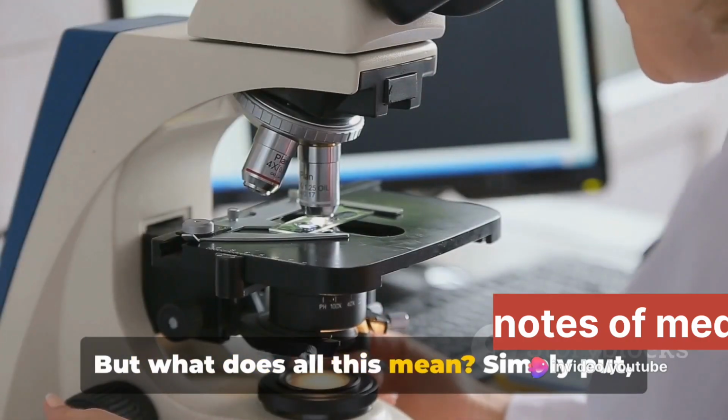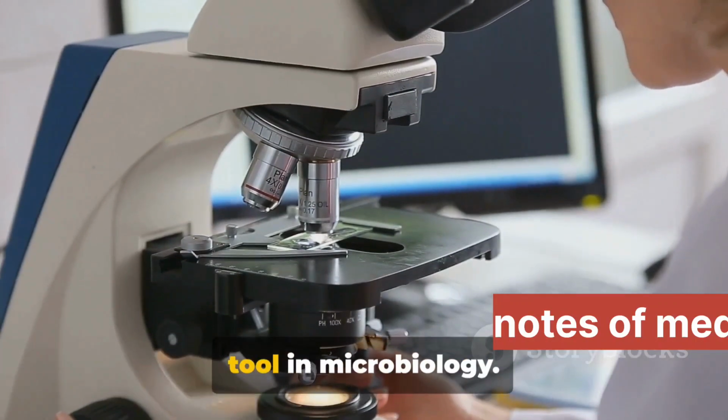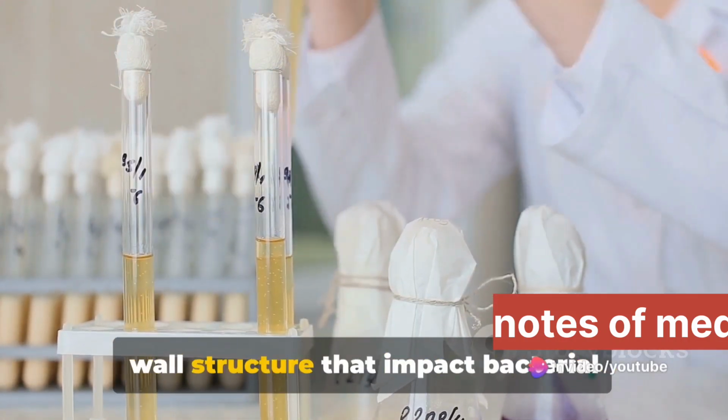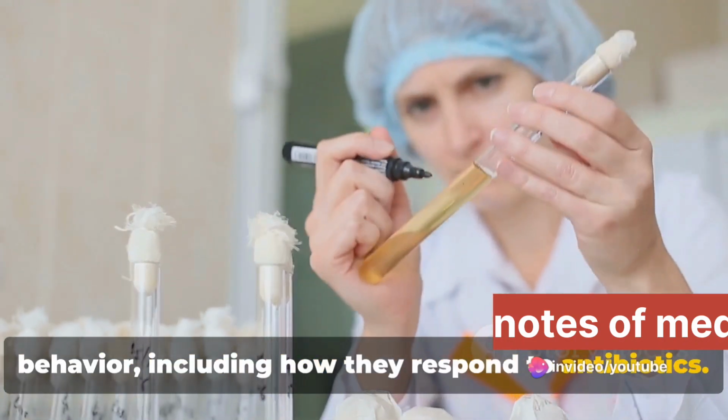But what does all this mean? Simply put, the Gram stain method is a fundamental tool in microbiology. It provides a snapshot of the bacterial world, revealing key differences in cell wall structure that impact bacterial behavior, including how they respond to antibiotics.